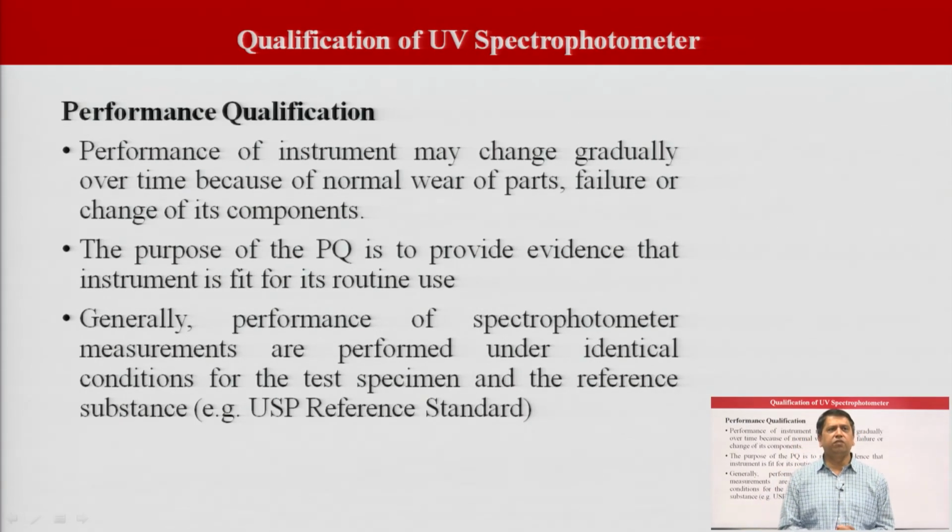Now, the last phase of the qualification of the UV visible spectrophotometer is performance qualification. The performance of the instrument may change gradually over time because of normal wear of parts, failure or change of its components. The purpose of the PQ is to provide evidence that the instrument is fit for its routine use.